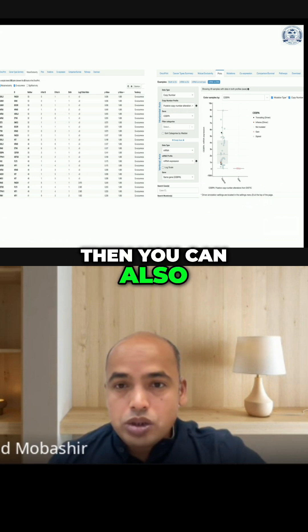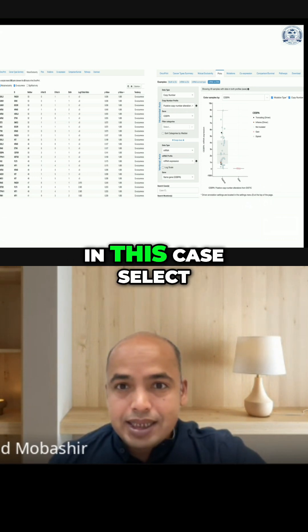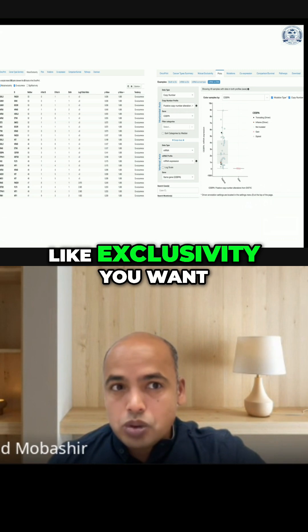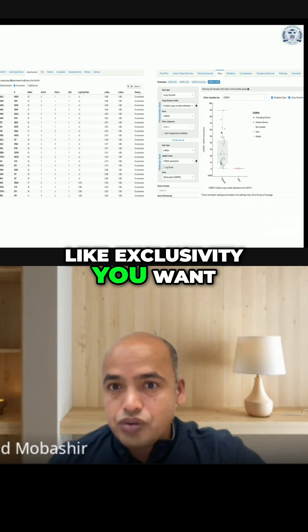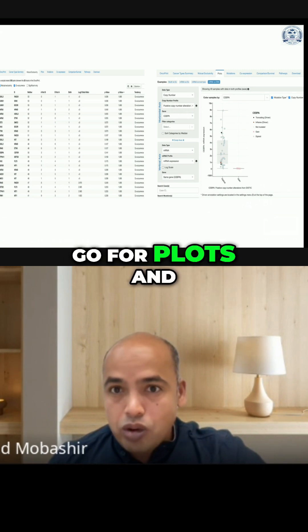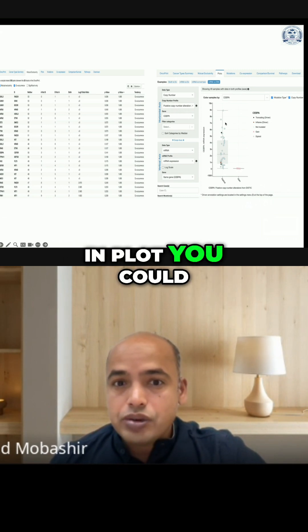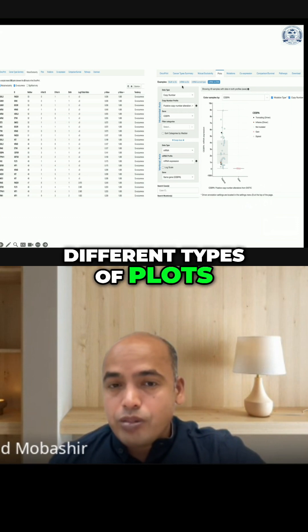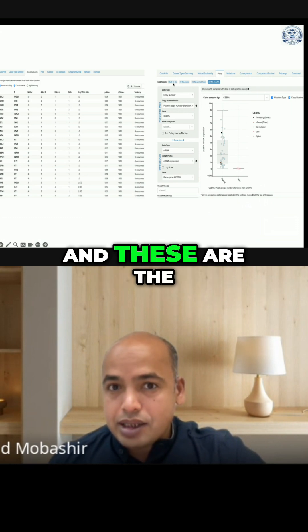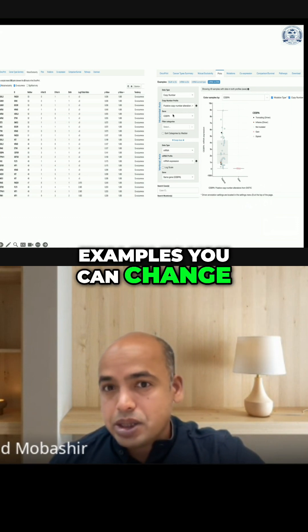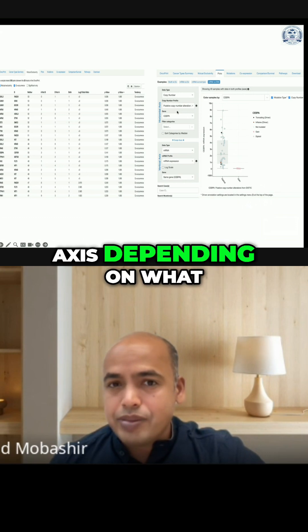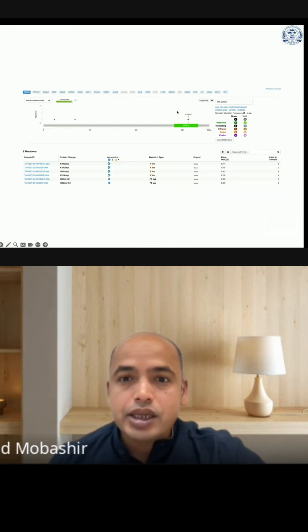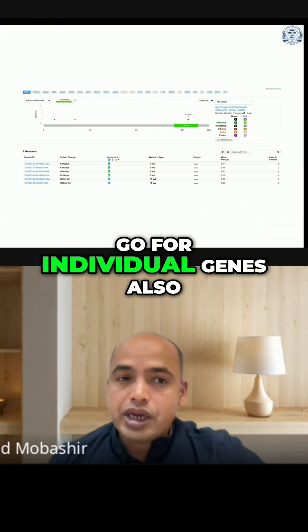You can also select what kind of exclusivity you want to see, then go to plots. In plots, you can choose different types of plots — these are the examples. You can change the x-axis and y-axis depending on what kind of data plots you want.